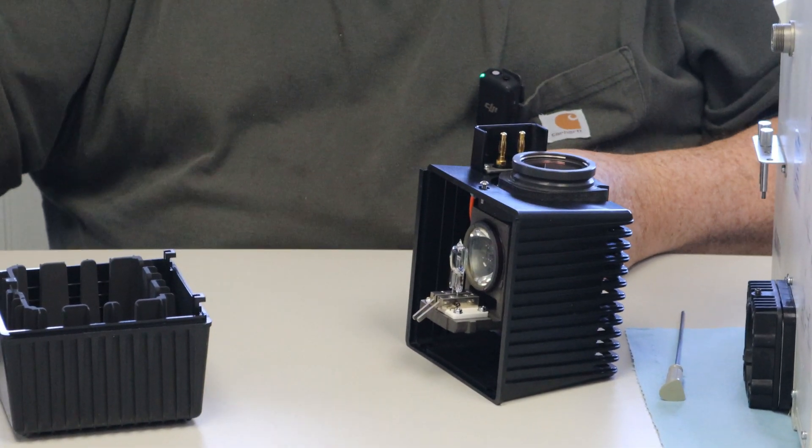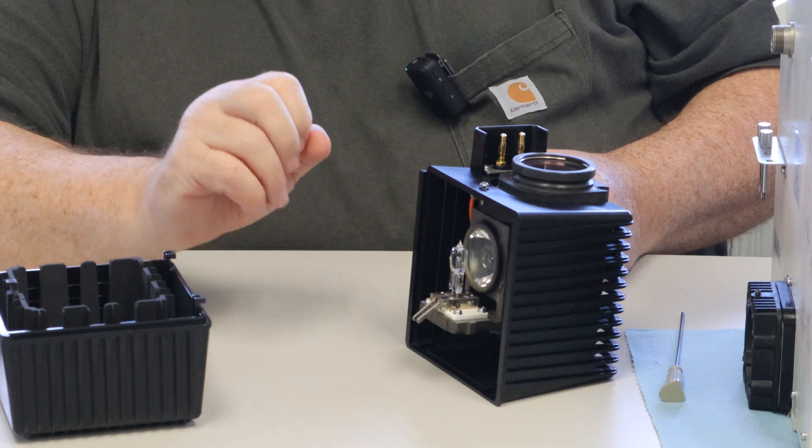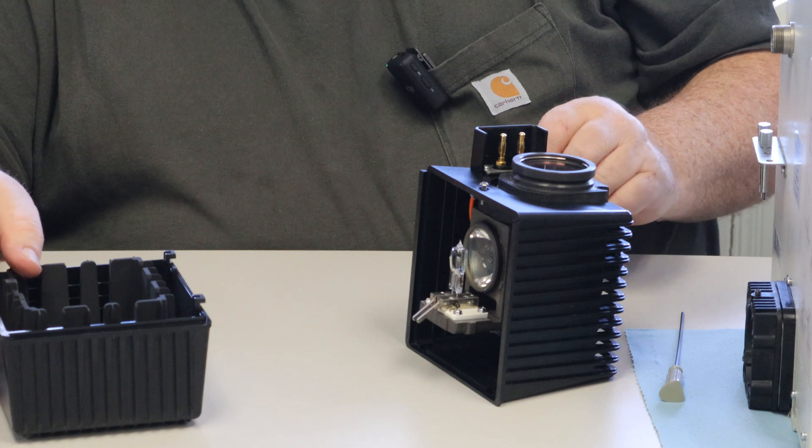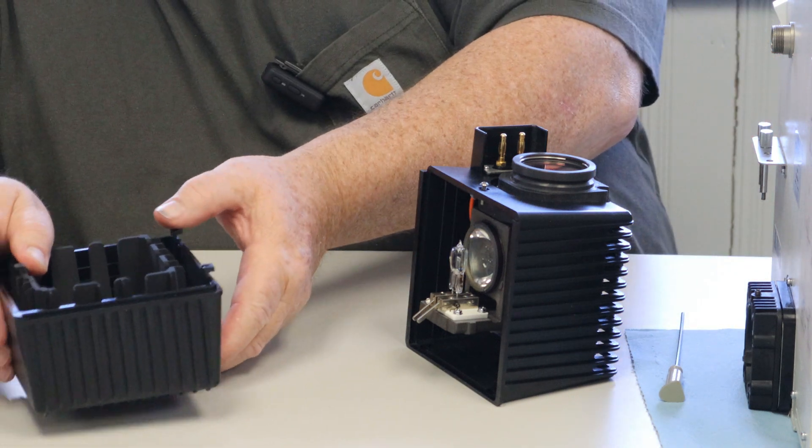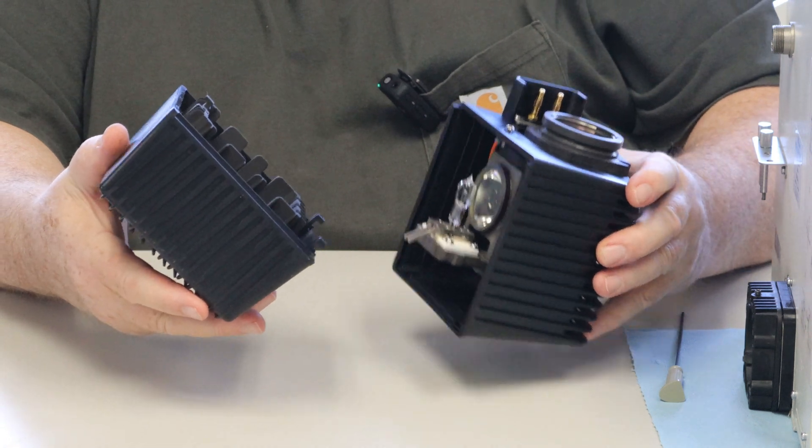Now if you do happen to get your fingerprints on the globe, you can use xylene, acetone, and a Kimwipe and simply wipe them off. But if you do not wipe them off, your fingerprints will burn into the globe and it will cause a shortened life to the bulb.